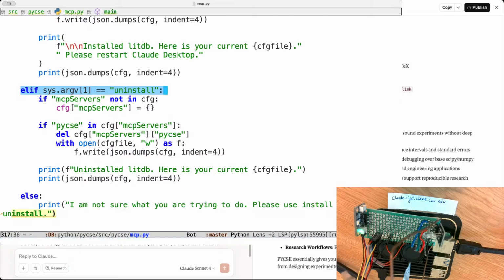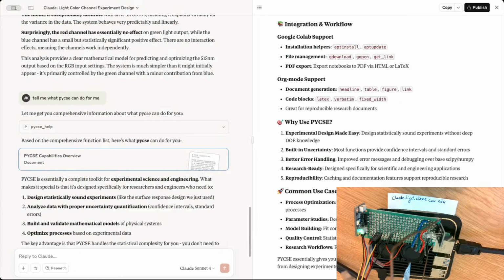So, okay, that's all this video is about, demonstrating this proof of concept that you can take a Python library and set up some Pydantic classes for structured data extraction from the prompts and the outputs, and have that call tools like a design of experiments and do analysis. There's still maybe a lot to be desired about the whole integration. Let's say it took a long time to do the experiments, you'd probably want to save the design somewhere so you could reload it, for example, and I haven't worked out many of those kinds of details.